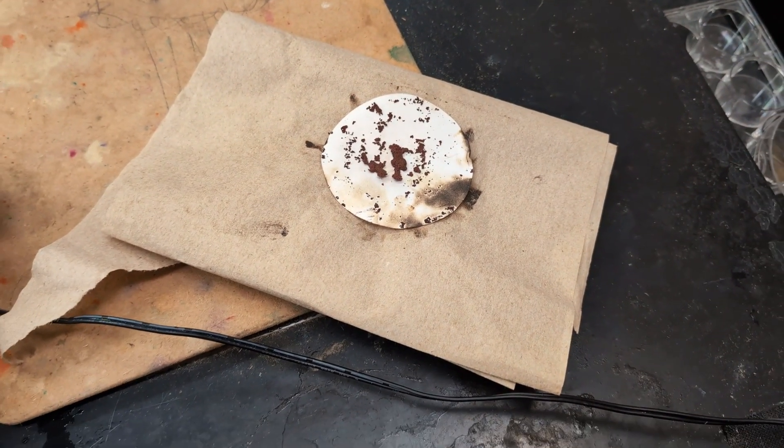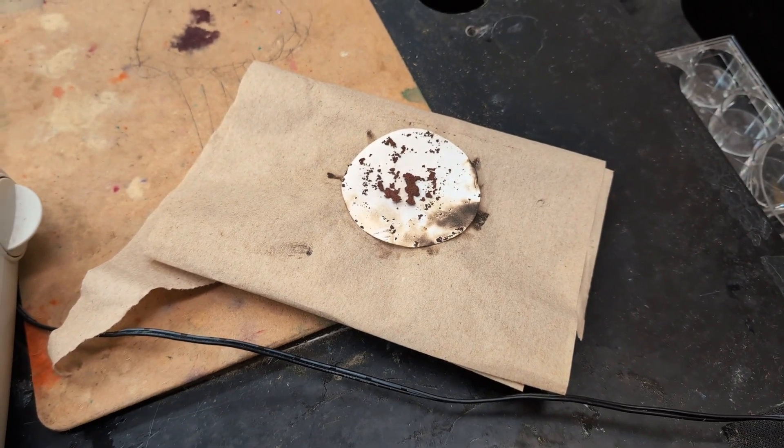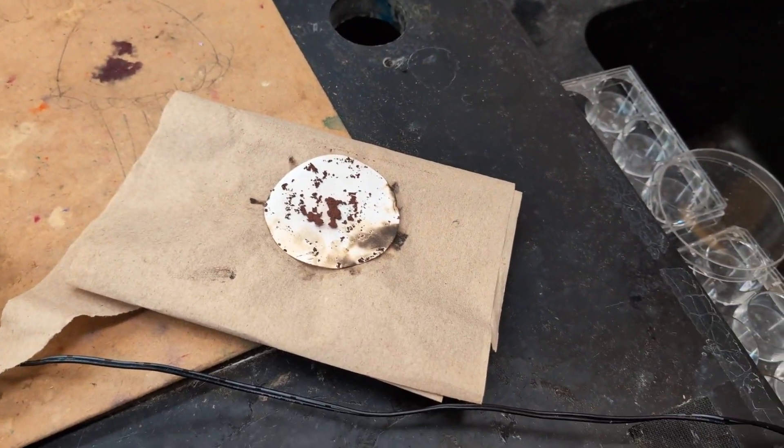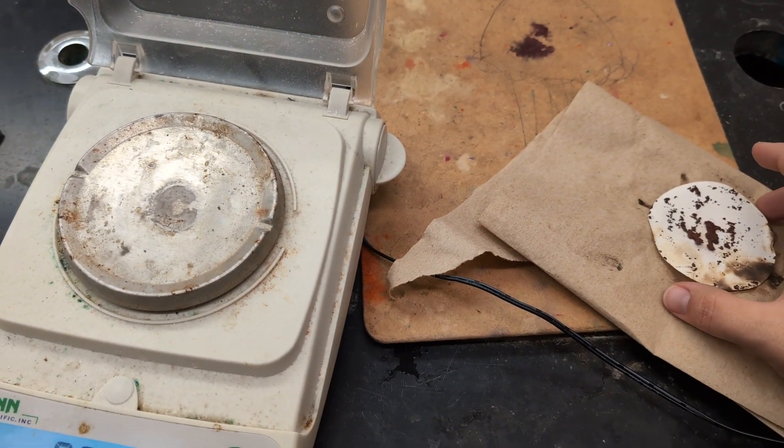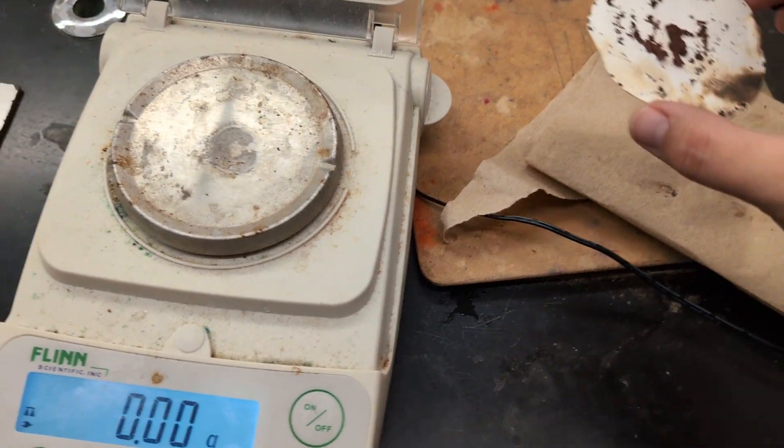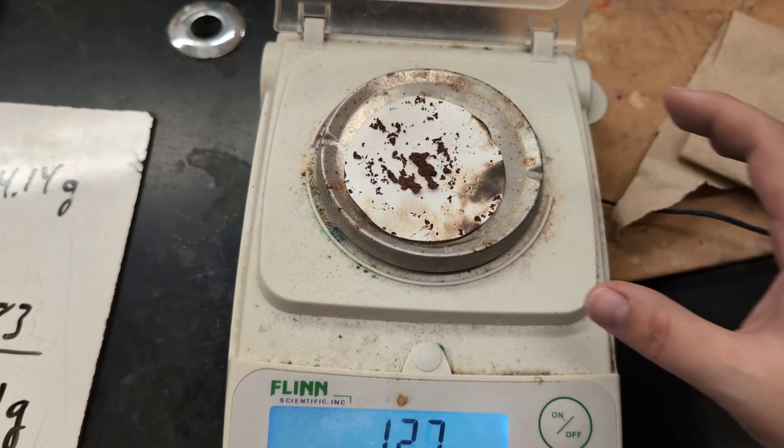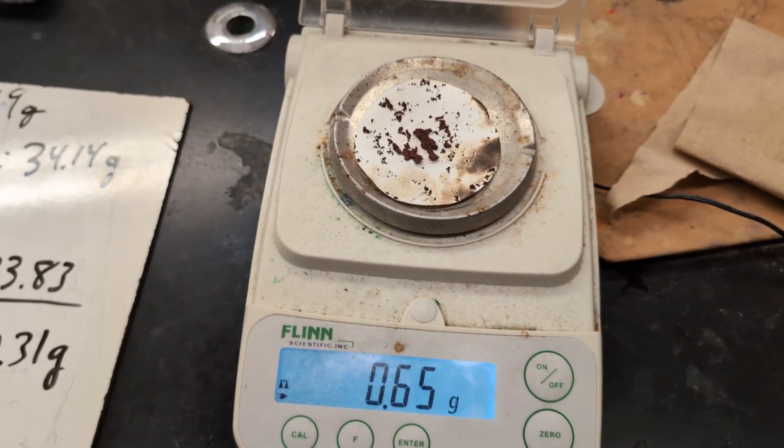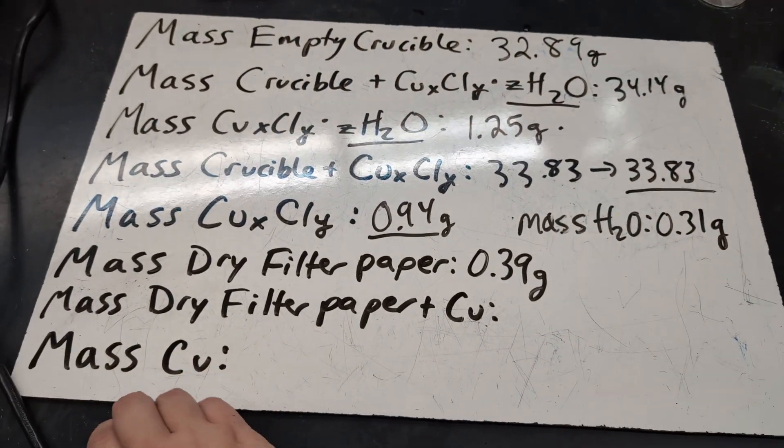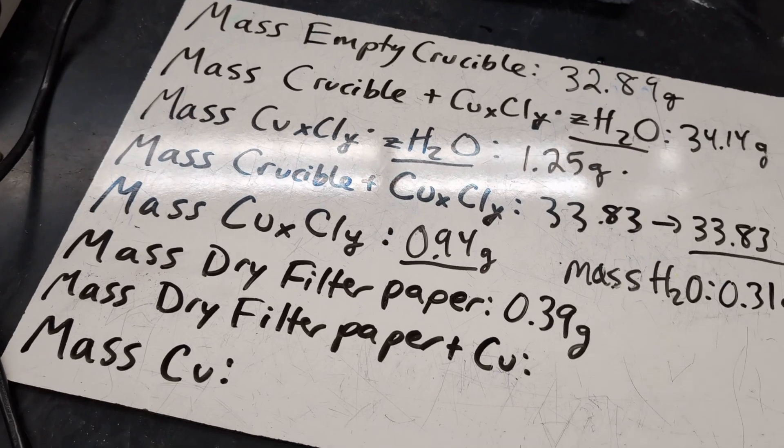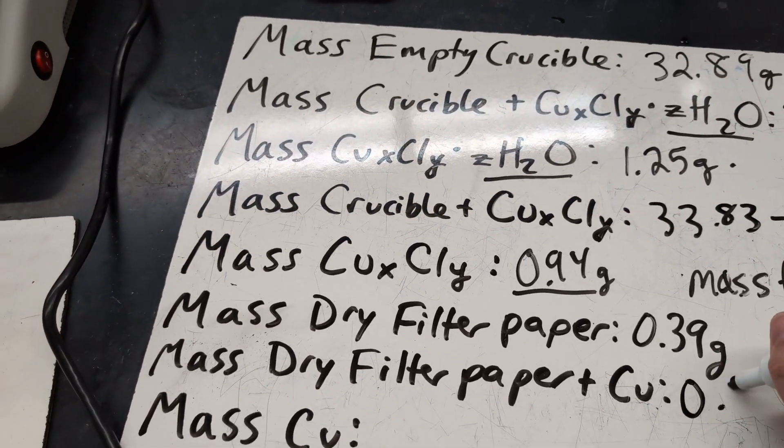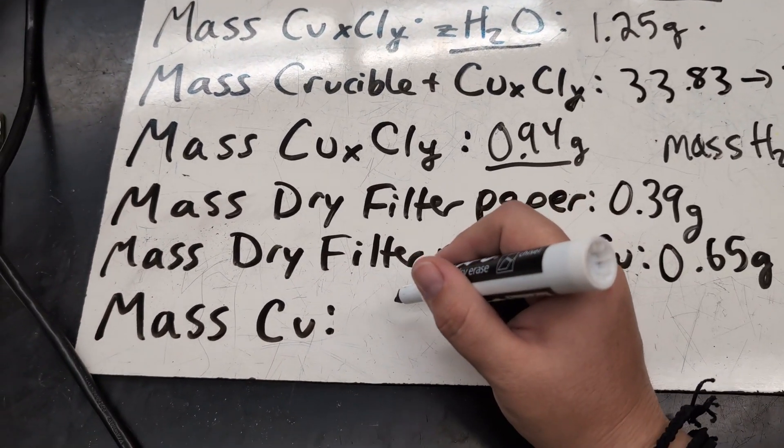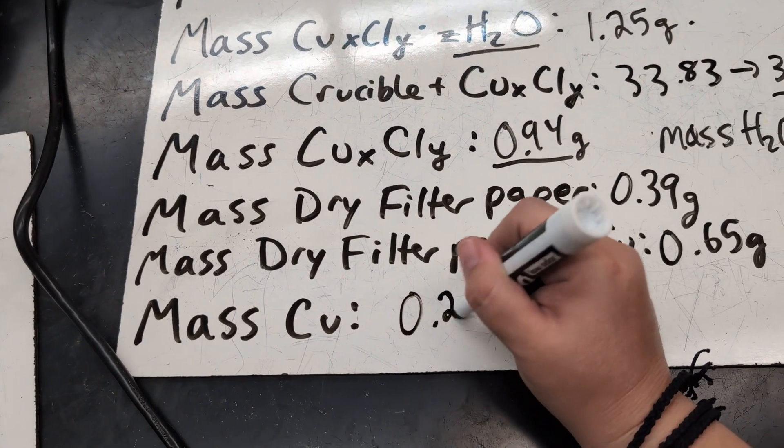So our solid copper has been drying. I took it out earlier and weighed it. And I took it out again and weighed it, put it back in. And so you want to keep going with that cycle until it reaches a constant mass. So you know that all the water has evaporated. And so this would be the final time. Yep, 0.65. So it has not changed from the last time I weighed it. So I can record that mass. And you can see that the filter paper with the solid copper is 0.65 grams. And so if you subtract out the mass of the filter paper, you get that the mass of copper that we formed was 0.26 grams.